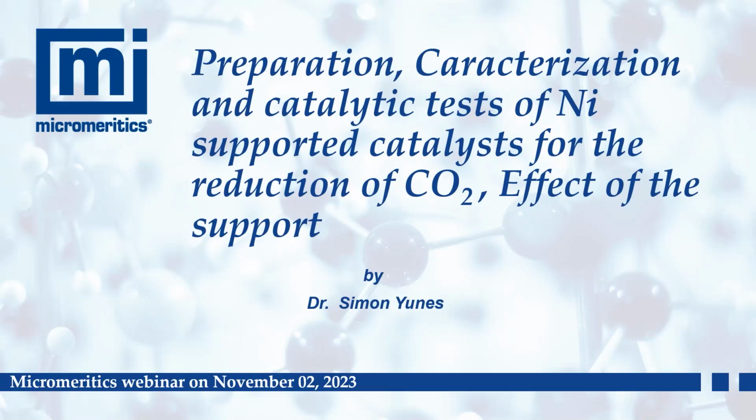And I'm going to present you some very specific and very simple stages or steps on how to prepare a catalyst, characterize it, and make a catalytic test. Taking as an example the nickel-supported catalyst for the Sabatier reaction, or the reduction of CO2, and the effect of the support on the activity of the catalyst itself.